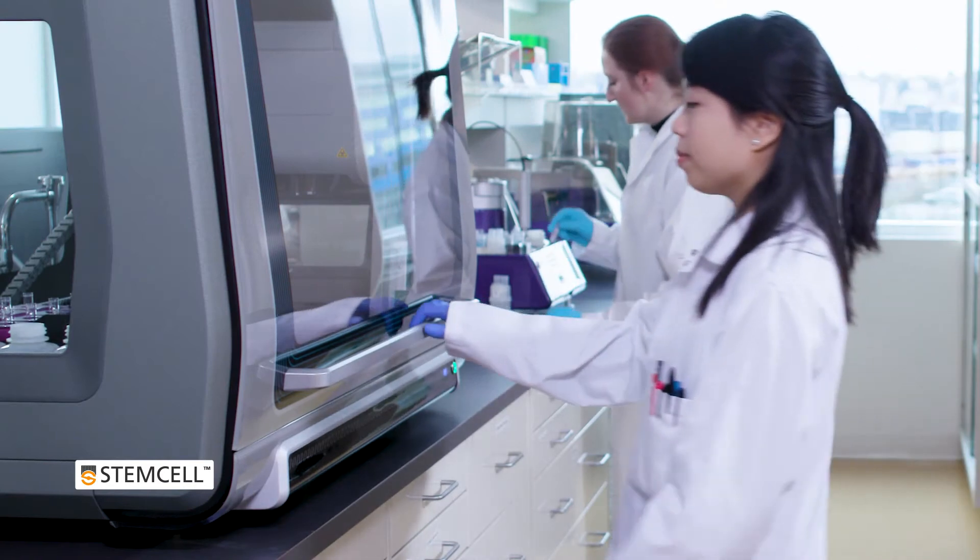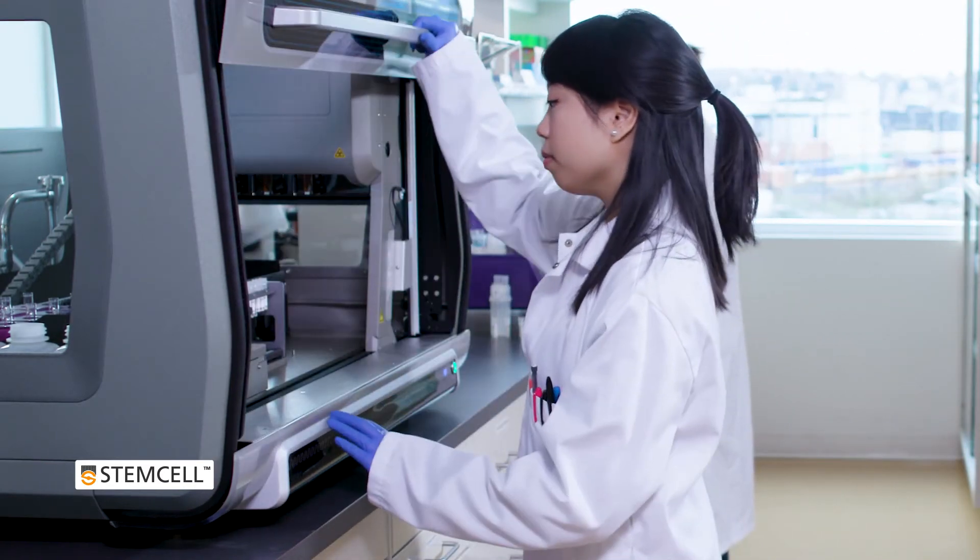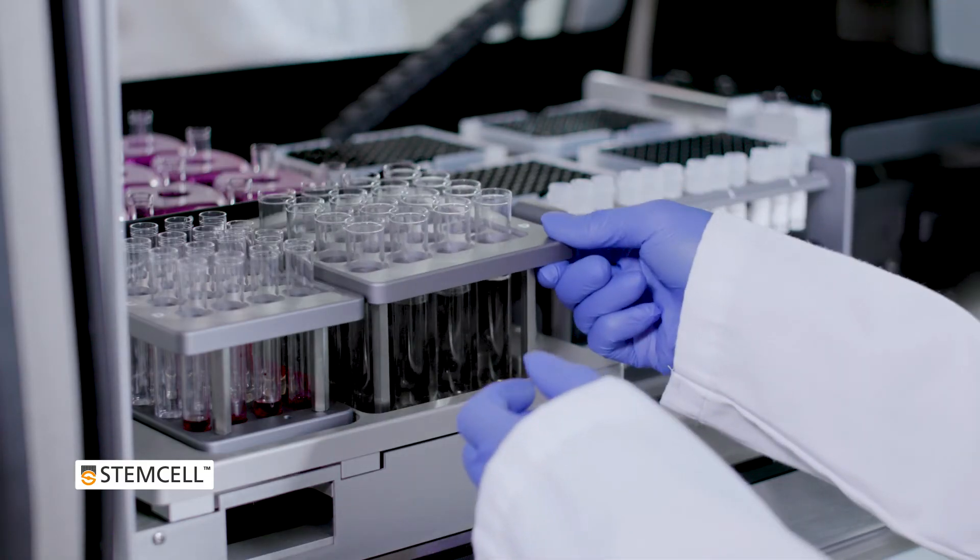Once the cell isolation is complete, the isolated cells are immediately ready for further analysis.